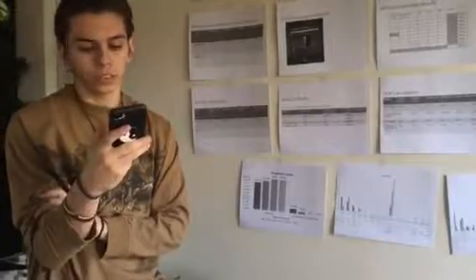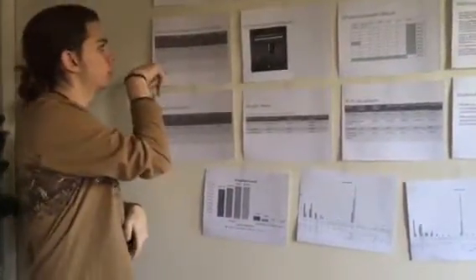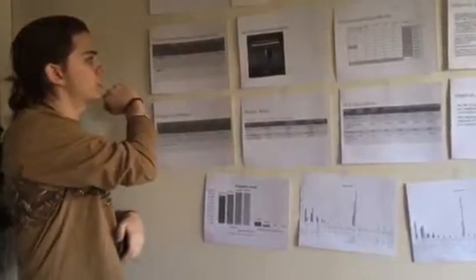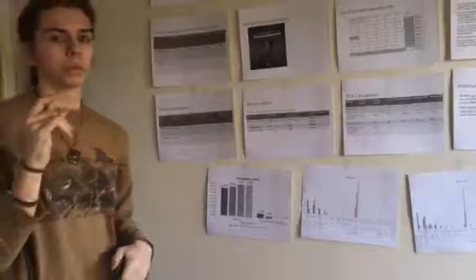Our 260/280 ratios for sample 645 and sample 428 were in between 1.5 and 2.2.